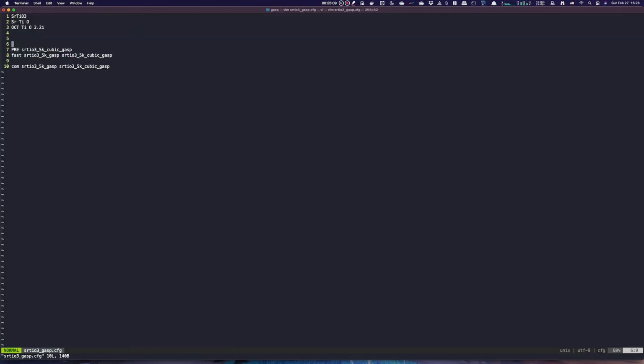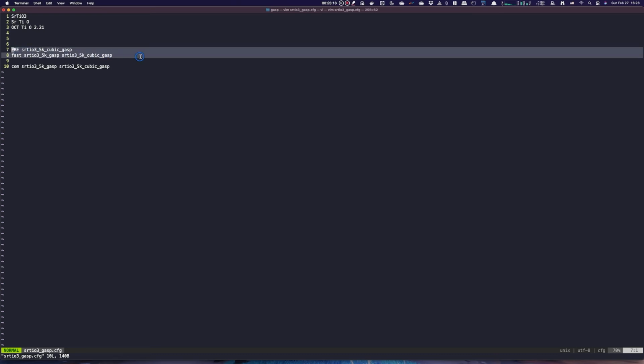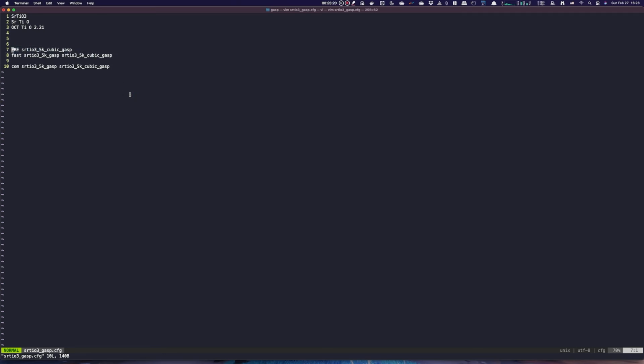And then probably you can open the control file for GASP, and you can see those keywords. To know what those keywords mean, you can refer to the GASP manual or the tutorial folder of the RMCProfile package. Here I don't want to go into details about those keywords. Basically, it's just to do some preparations on the structural configuration, and then to do the final comparisons between these two structural configurations.